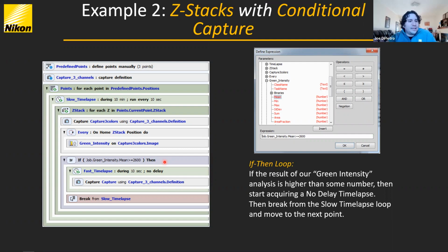But that's not the point of this. The point is that this is just an example of what can be done. You can choose a bunch of cells, take images of them, measure on the fly some aspect of the structures that you're interested in, have it determine if you've passed a threshold that is meaningful to your data and to your experiments, the size of the cell, the intensity of a fluorophore, the shape of an object, and on and on and on.